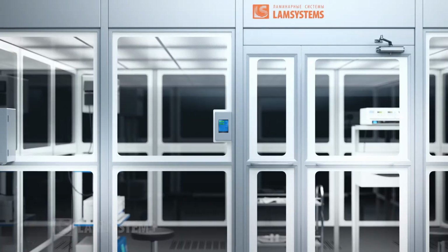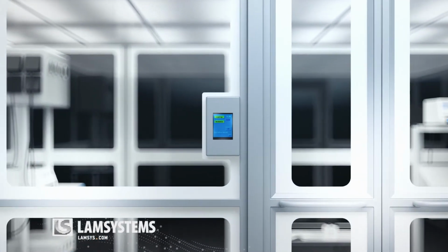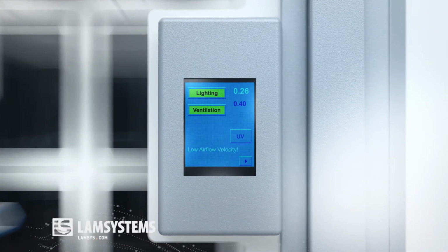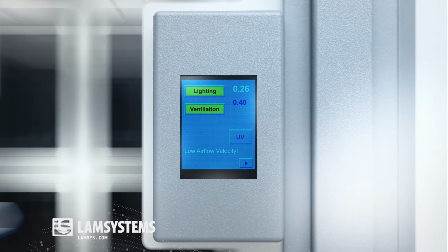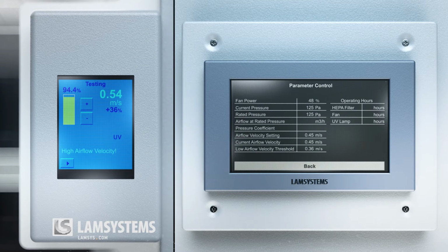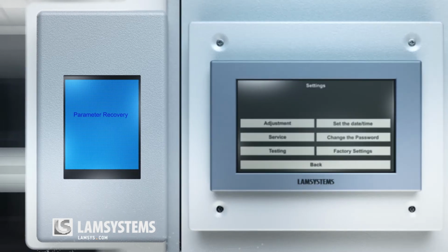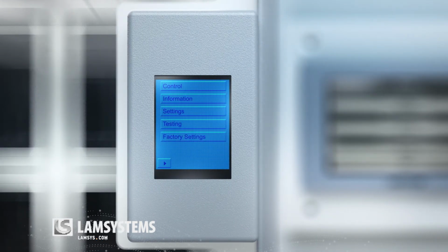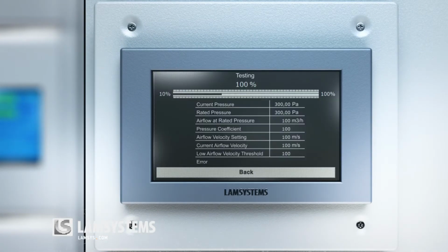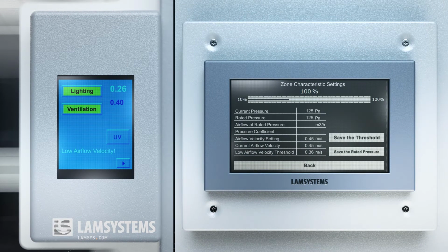Control. Besides on-off function, the control panel of the clean zone also provides control of the lighting, parameter setting, operation mode selection, and current clean zone status monitoring. The control screen indicates relevant service information, possible faults, and alarms. There are two types of control panels, with a small touchscreen that has a limited number of functions and with a bigger touchscreen for multifunctional specialized zones. Both of the screens allow wet disinfection and operation in gloves.